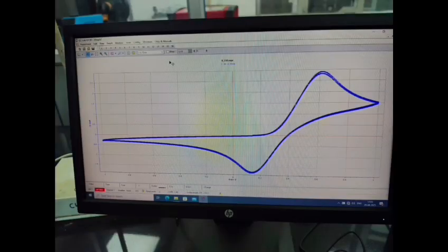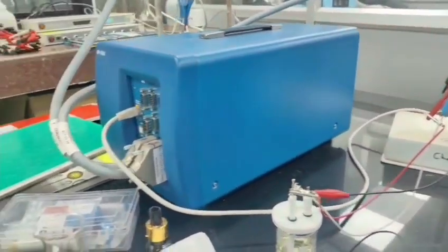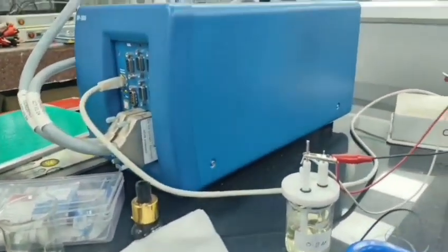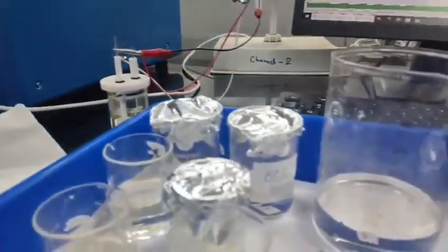Here the readings are noted. This is the potentiostat. And this is the whole setup. Now we have taken the reading.